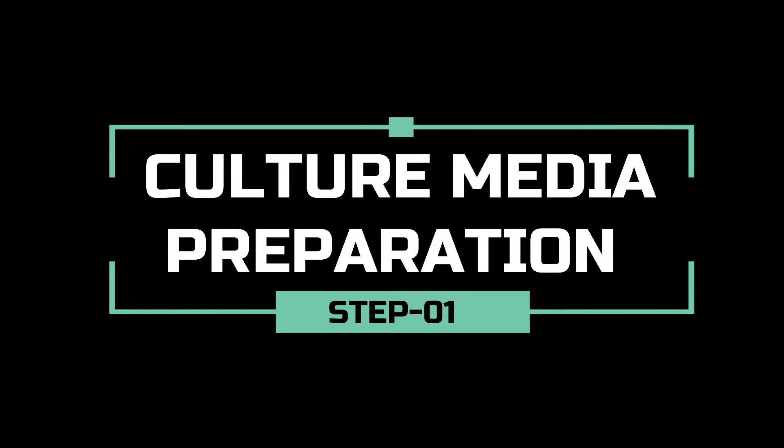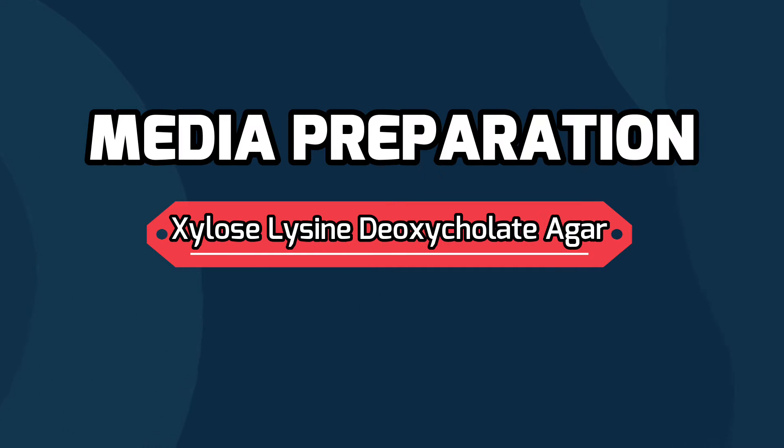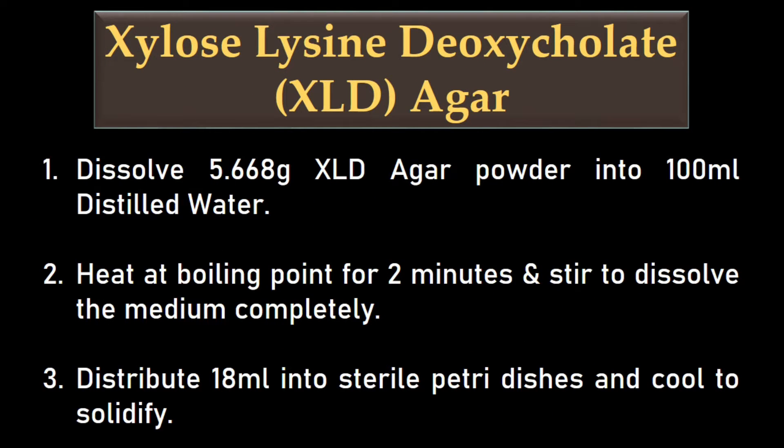First, we will prepare culture media. We can prepare xylose lysine deoxycholate agar media by dissolving 5.66 grams XLD agar powder into 100 ml distilled water. Boil at 100 degrees Celsius in a microwave oven for 2 minutes. Distribute 15 ml into sterile plates.